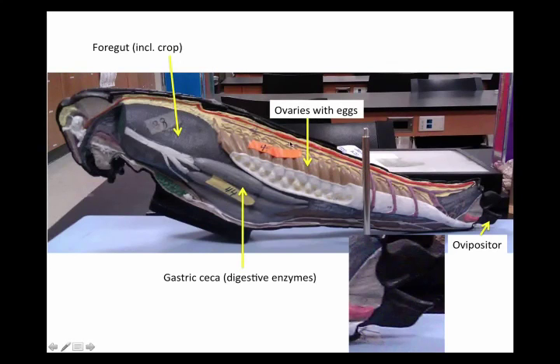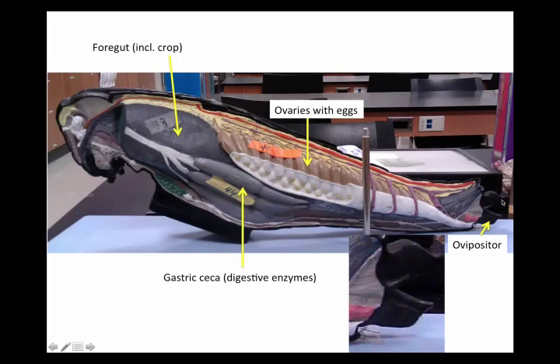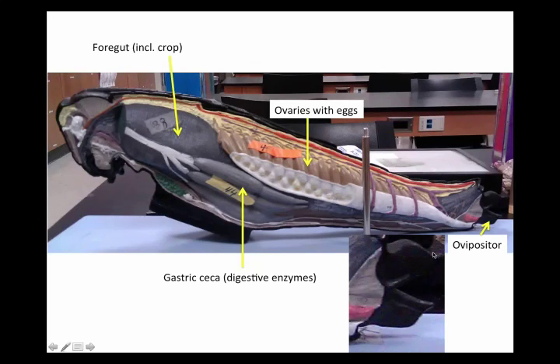The circulatory system includes the heart and dorsal blood vessel up here. The brain comes down into the ventral nerve cord, like most of these organisms. At the posterior end, we can tell this is a female — she has eggs and an ovipositor, which is a branched structure with two sides where her eggs come out. Females are the only ones with an ovipositor. If a grasshopper has two pointy parts on the posterior, it's female; if it lacks them, it's male.